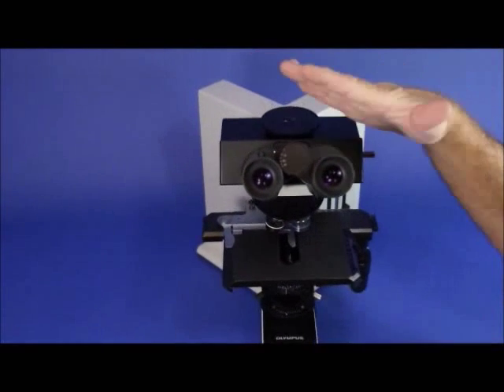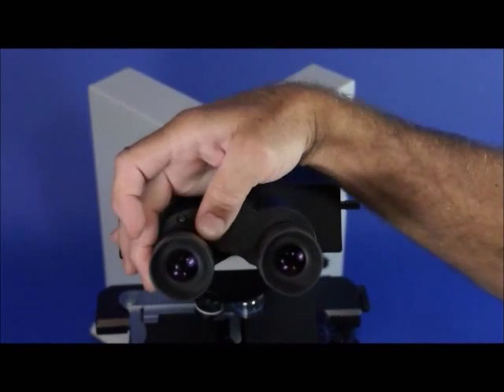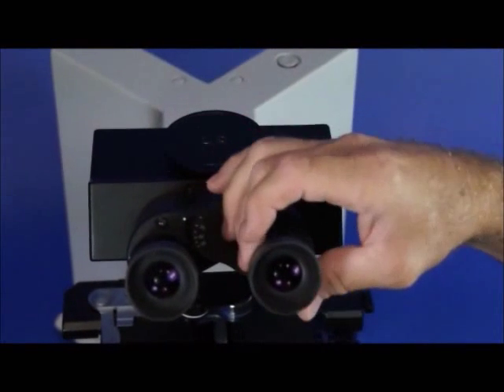First of all, starting at the very top, we have a diopter that's adjustable on the trinocular head on the left side. The right side is fixed.